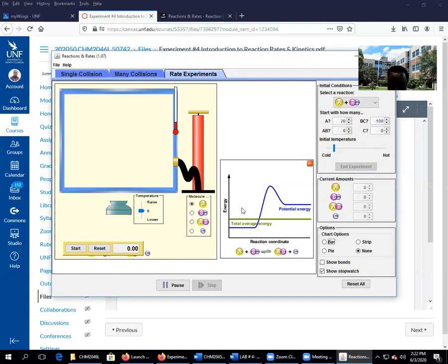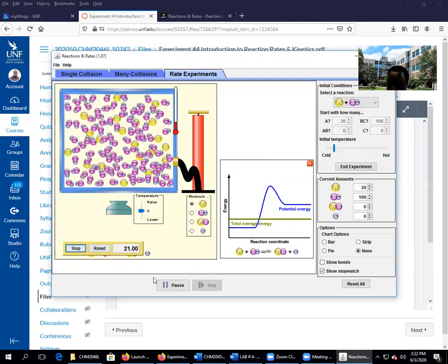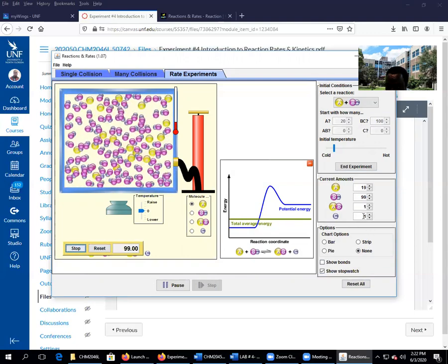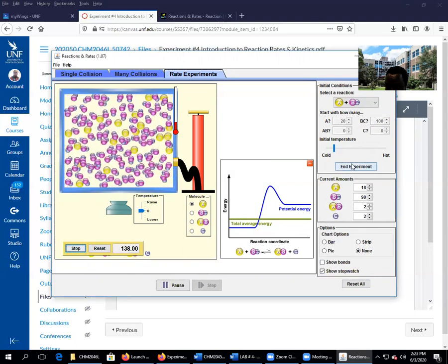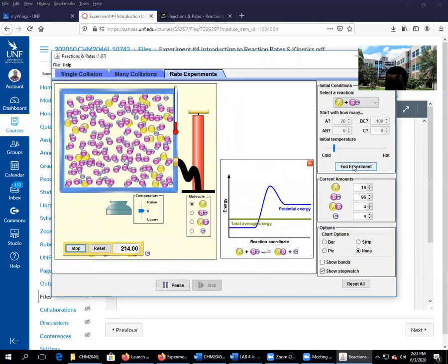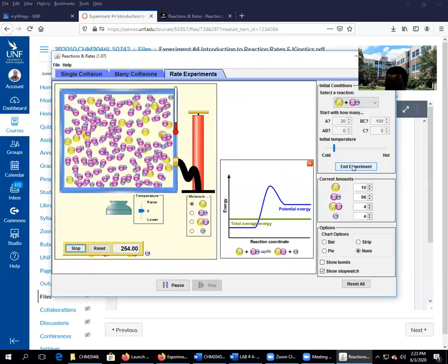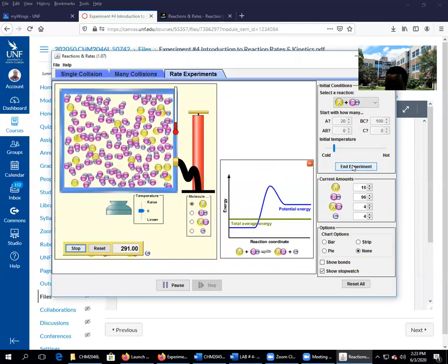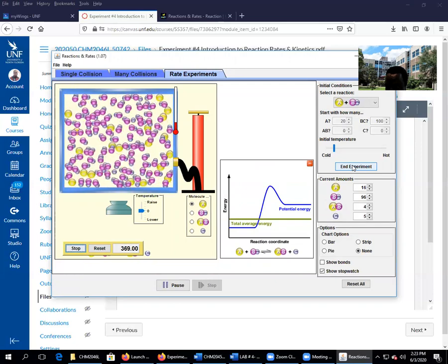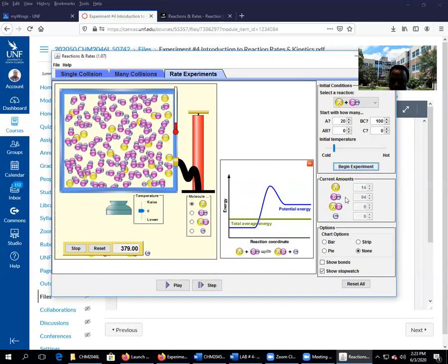And then begin the experiment and start the stopwatch at the same time. So I'm waiting for this number to reach 5 before I end. It's just right here. I'm ready. Stop, stop, stop. Stop, yes, right. Oh, I messed it up. You have to repeat again.